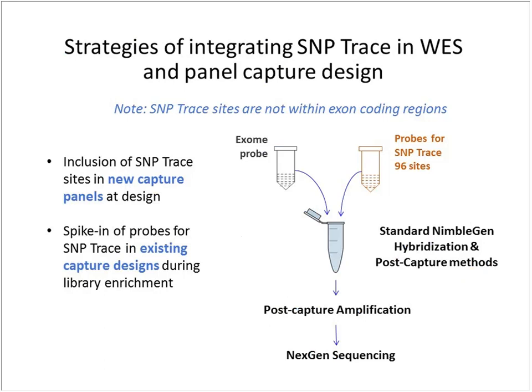So for any new panels, we include the SNP Trace sites at the very beginning when we design the panel. For the existing capture designs we have been using for several years, we do not want to change the current design.